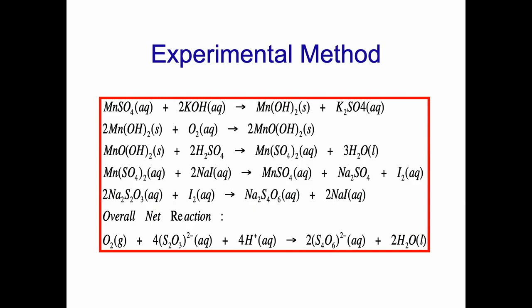Today, you know, they have the fancy dissolved oxygen meters, which we're not using, but you can just drop it in and get your DO. They use this method to calibrate those meters today. So you're going to be doing the real chemistry here. The whole method is based on that if you've got oxygen in the water, iodide is going to get oxidized to iodine, and you're going to be able to titrate the iodine with sodium thiosulfate. So let's just go through the method just a little bit here.